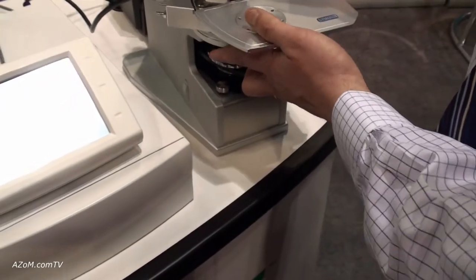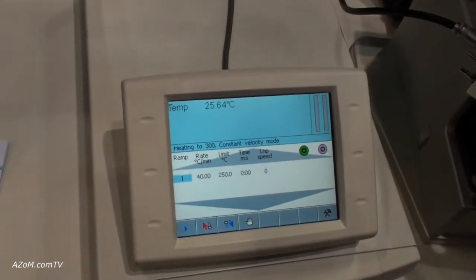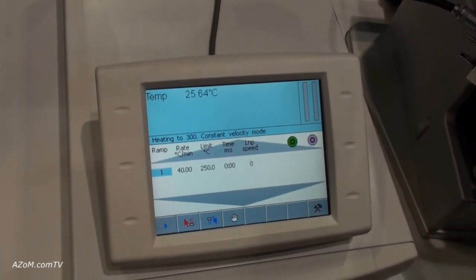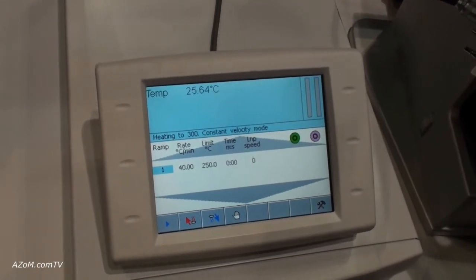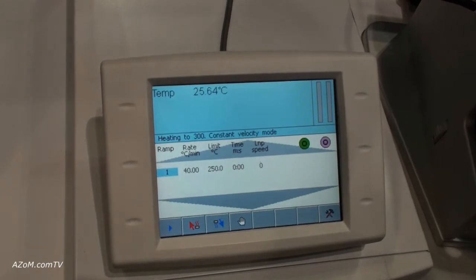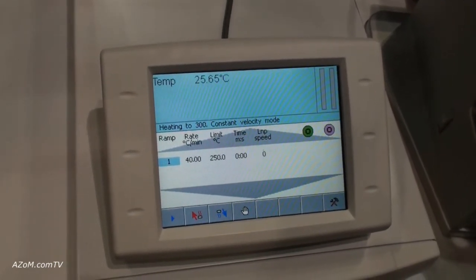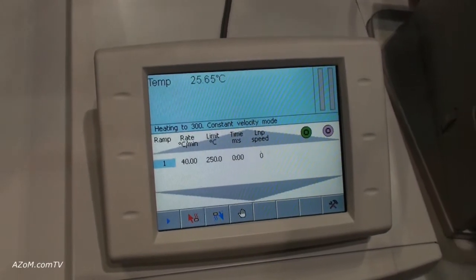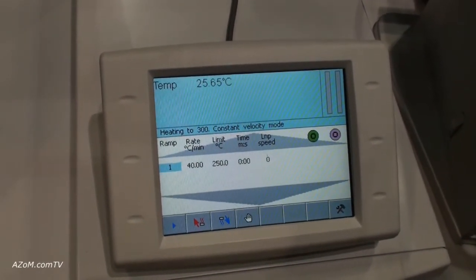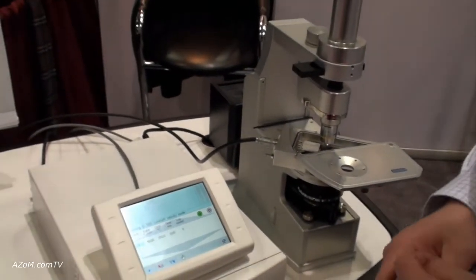Going back to the T95 now — the T95 offers greater resolution up to 0.01 degrees Celsius, the best temperature accuracy of any thermal stage on the market at 0.01 degrees Celsius. It also offers the fastest temperature rate on the market at 150 degrees Celsius per minute. And as mentioned, with this particular 420 stage, we're looking at 40 degrees Celsius per minute.